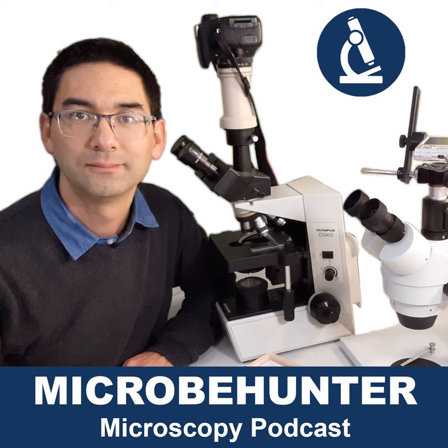A second point that would speak towards stereo microscopes is if you do microscopy with smaller children, okay? Because the stereo microscope gives a three-dimensional image, and it also does not flip the image around upside down. The image is much less abstract, so children can probably relate to it much better, and it's also much easier and faster to do microscopy, because the only thing that you do is you simply drop the object you want to look at under the microscope, and you look at it.